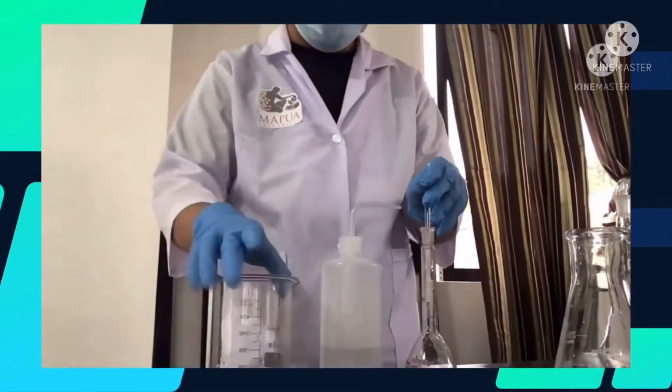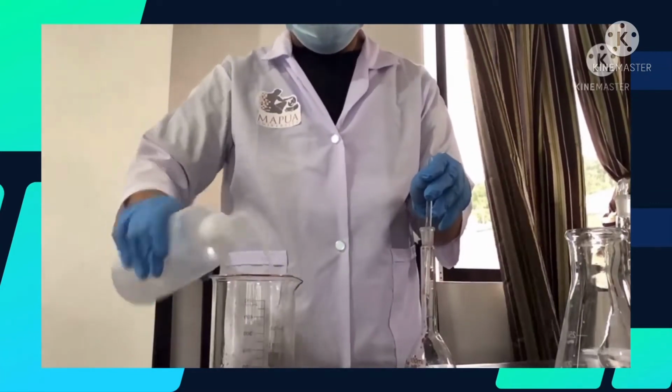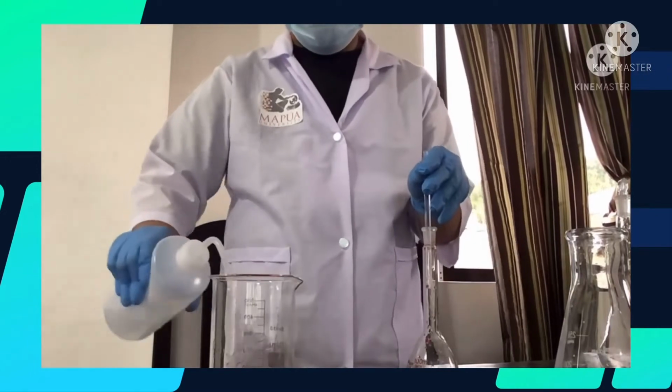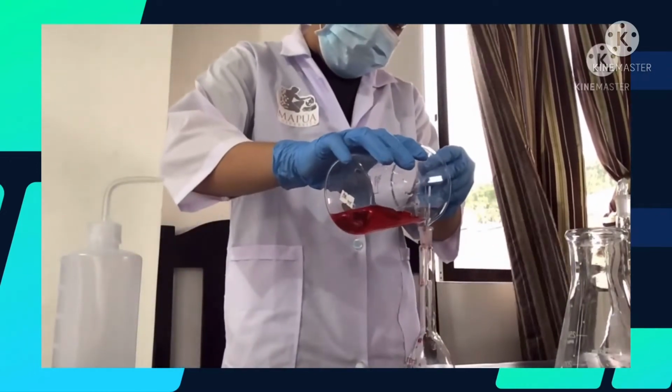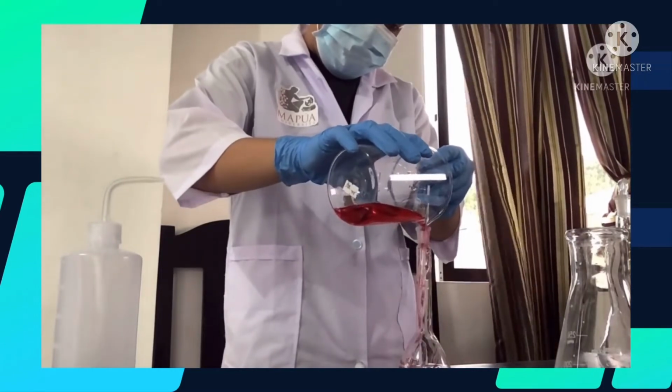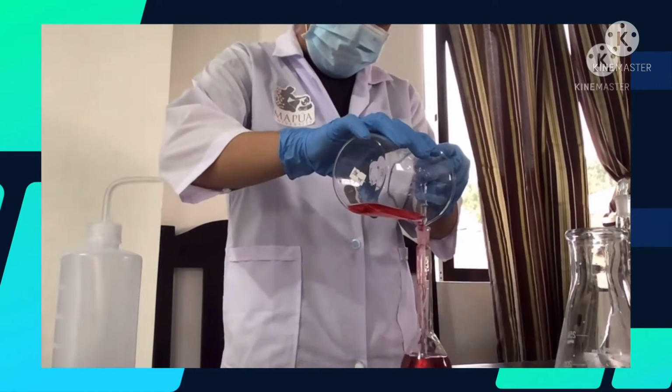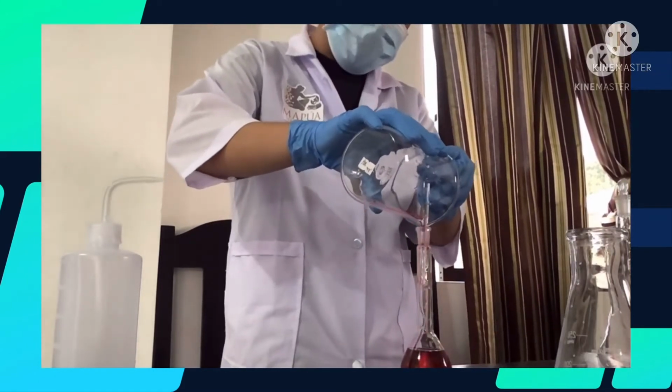Wash the remaining solution in the beaker by adding more water to the beaker. Stir and transfer it again to the volumetric flask, following the same procedure. Repeat this washing until no trace of color of the solution remains. Record the number of washings made.